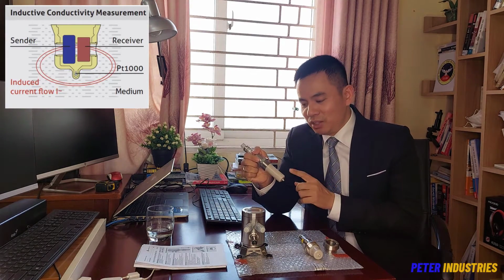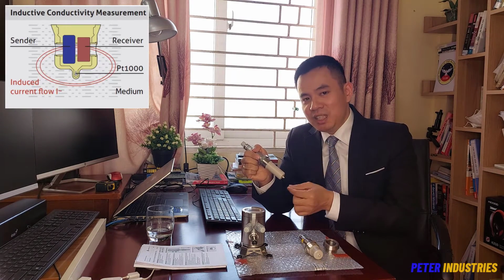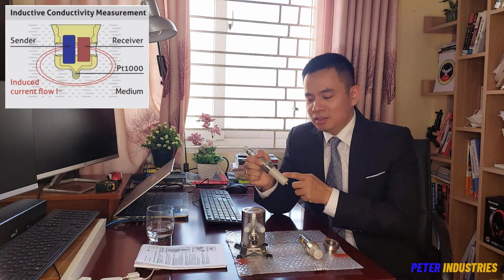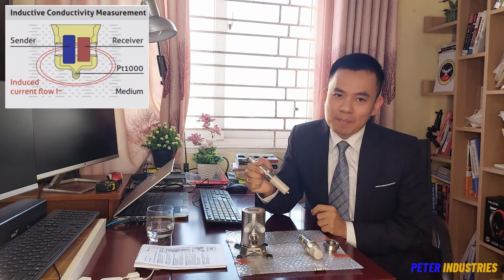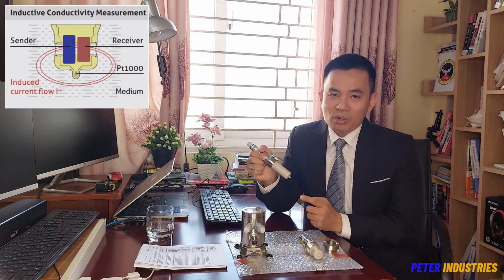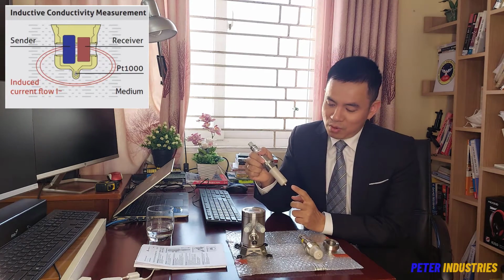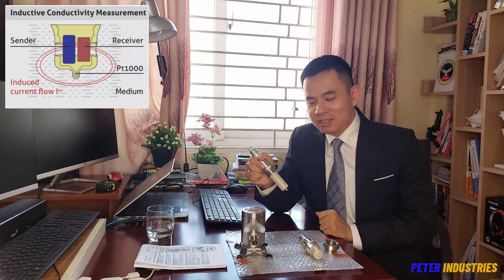The strength of the current flow in the receiver coil depends on the conductivity of the media. So we can calculate the conductivity of the media based on the strength of the current flow in the receiver coil. And as conductivity depends on the temperature, this sensor also integrates one temperature sensor, PT1000, for error compensation to maintain the high accuracy of the device.